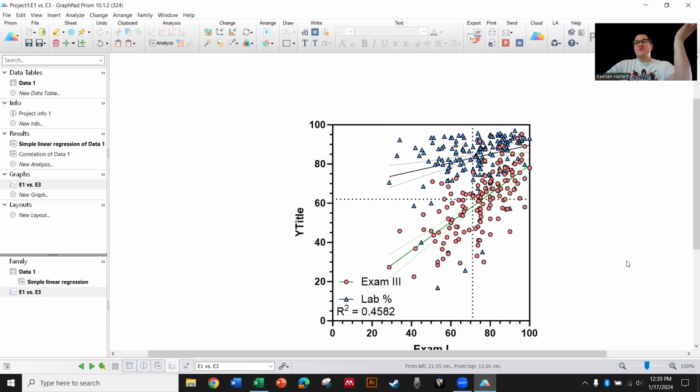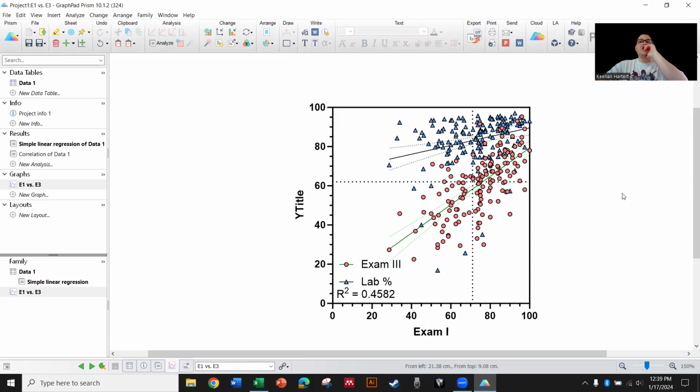You can always find a place for your legend if you can reduce the text size. That corner seems pretty good right there. Sweet. So that's how to do multiple little populations in an XY. Looks really colorful. This is also how you can detect covariations, et cetera.